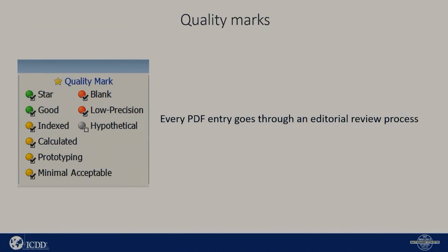Every entry in the powder diffraction file goes through an editorial review, and it's assigned a quality mark based on our editorial assessment on the quality of the data. Remember, we have data that ICDD has been involved with the collection, but we also are working with data collected by scientists around the world. And not everyone does the same data collection, not everyone has the same data quality. So we do the evaluation, we assign the quality mark, so you get a sense about how good the data are.